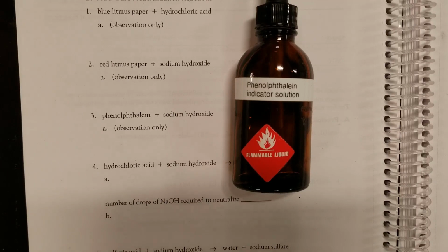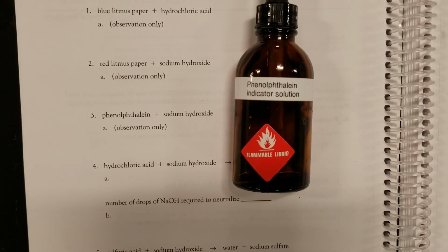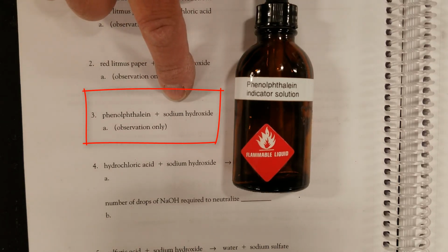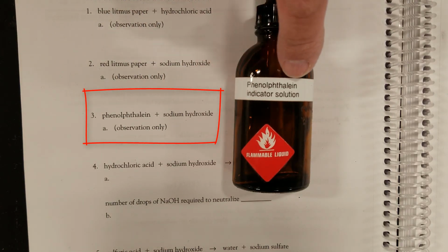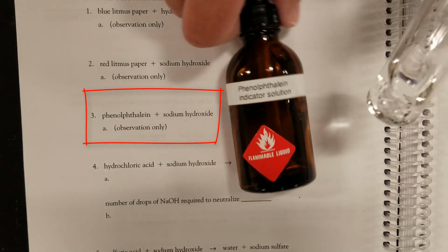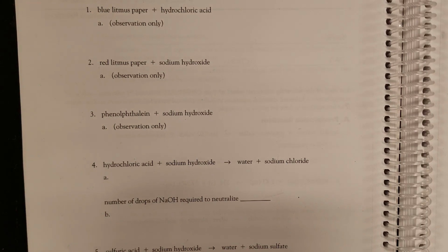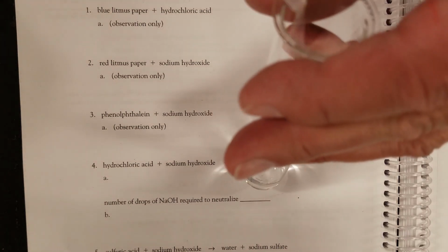Okay guys, we're on number 3 here. We're going to explore what happens when you add sodium hydroxide to a solution of phenolphthalein. So, here's our large test tube with some water. We'll add 1 drop of phenolphthalein.